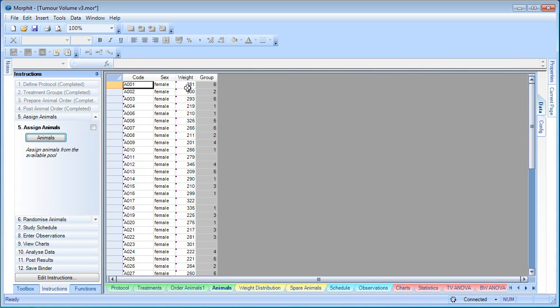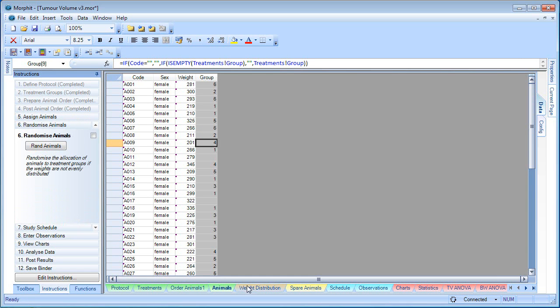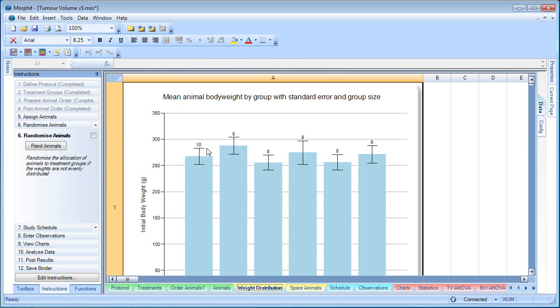The animal codes come through, their weights, and we're automatically assigning the animals to the groups randomly. We can review the weight distribution of the animals across each of the groups. And if we don't like it, we can re-randomize.